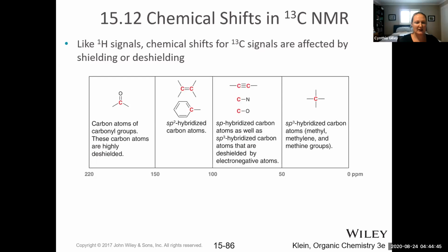So carbon-13 is not used as like, here's a carbon-13, analyze the spectrum, tell me exactly what the structure is. That's usually not the way it works. It's more like it's given to you in addition to a proton NMR, and you just use it to confirm the product after you've done all the assignments for the proton NMR spectra. You can use it to ask yourself how many unique carbons are in the structure. That can give you information on symmetry. Like if you have 10 carbons, but you only have 7 signals, then you know that 3 carbons are equivalent. So that can give you some information as well.